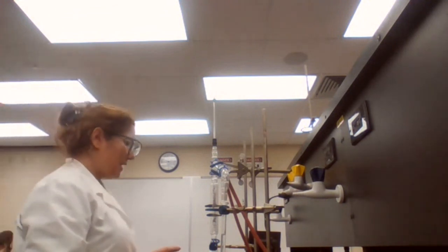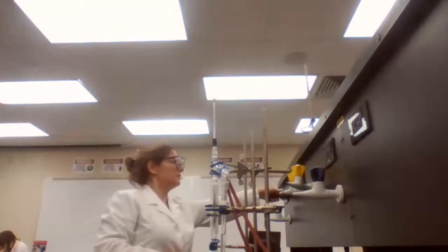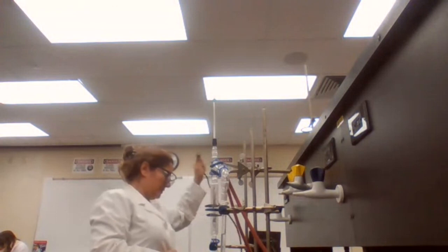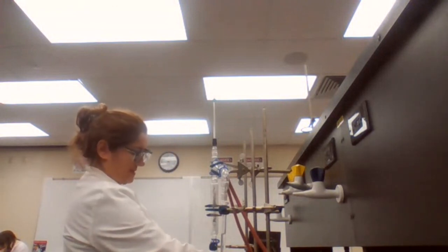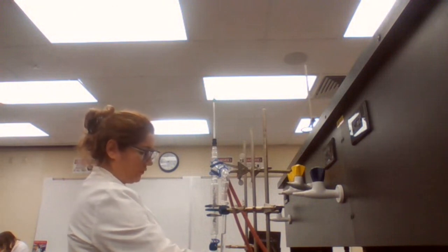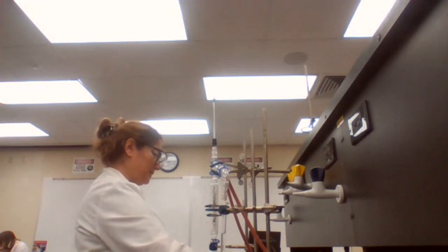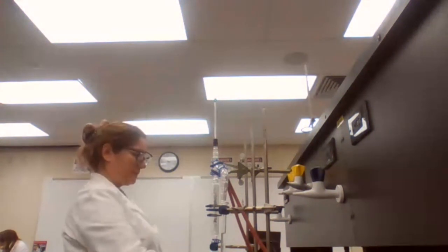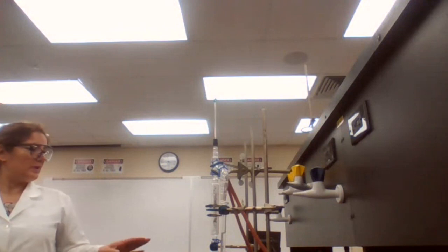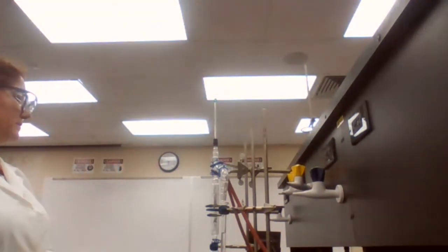Okay, going to stop the heat. Turn off the heating mantle. I'm sorry, the power regulator. Unplug. Lower the ring to lower or remove the heating mantle. Put it on the side to cool down. And wait for all the vapor to go to the condenser.